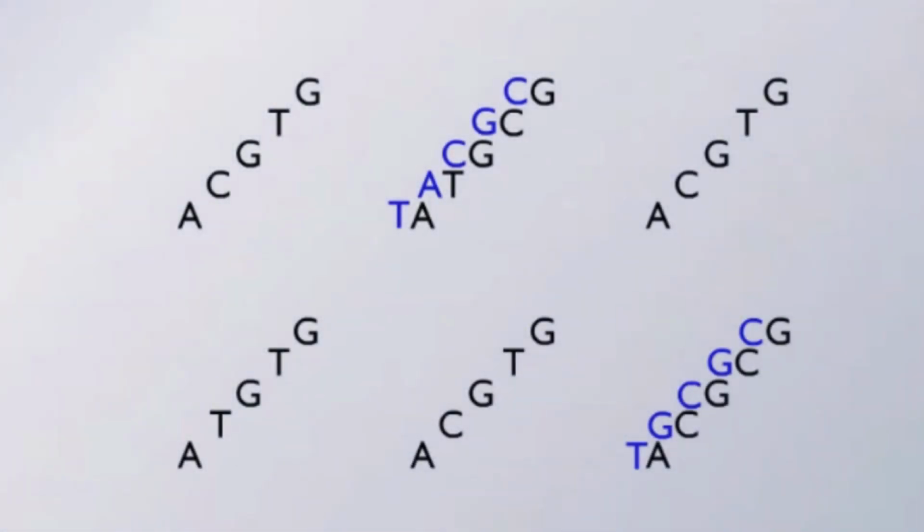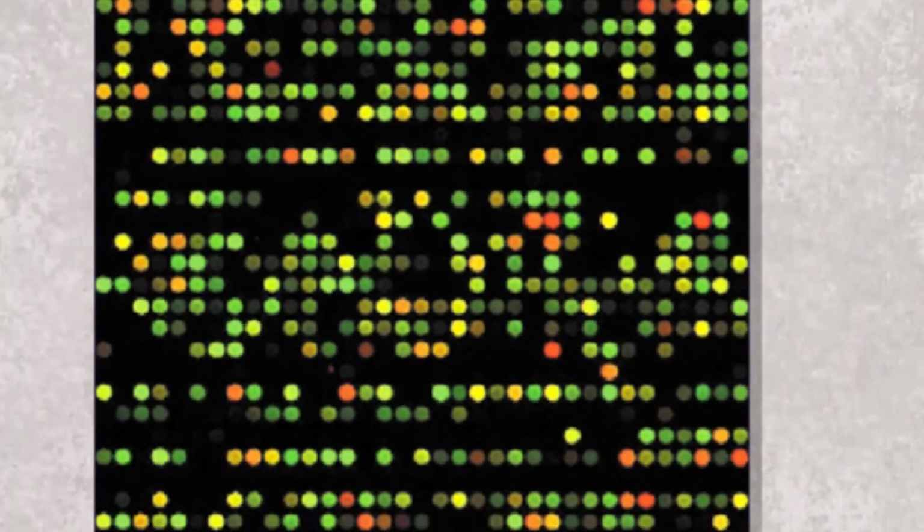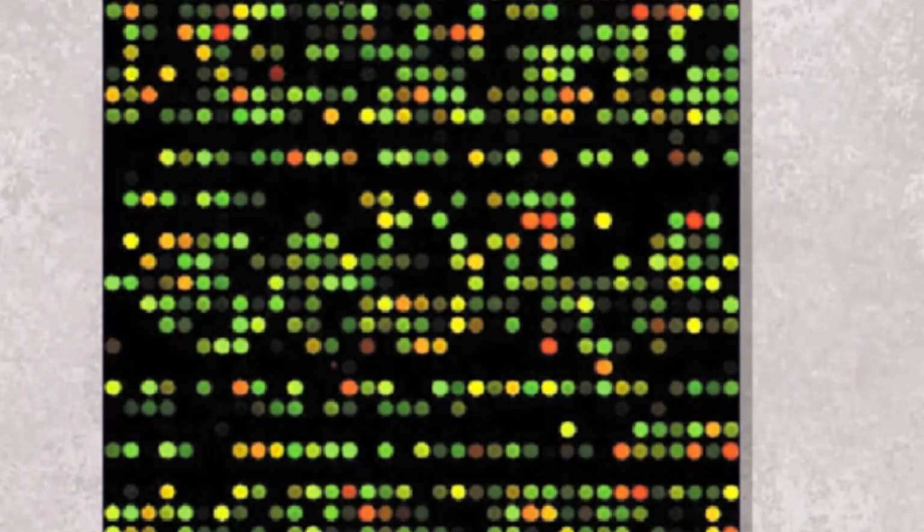The surface of the microarray is then scanned with a laser beam and the data obtained is used to produce a visible image. Color intensity indicates the extent of hybridization to the different probes. Over 200,000 probes can be constructed on a single microarray. With this technology, any desired sequence of nucleotides can be constructed to form a probe.